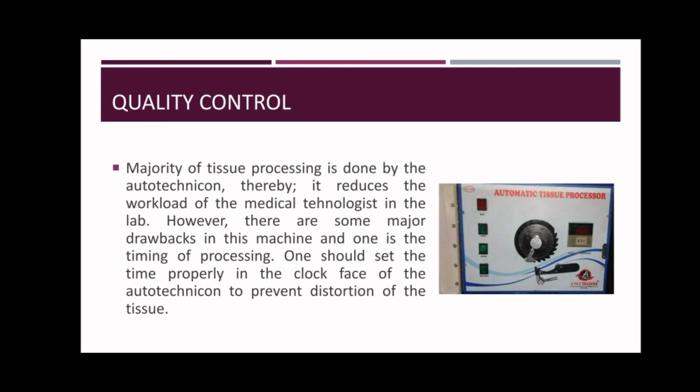In each laboratory section, there's always QC. The majority of tissue processing is done by the Autotechnicon, thereby reducing the workload of the medical technologists in the lab. However, there are some major drawbacks in this machine, and one is the timing of processing. So it is very important that you set the time and calibrate the machine properly so that it will hit the exact time, and the tissue will not be overly fixed, overly dehydrated, and also not under-fixed, under-dehydrated, under-cleared, and under-infiltrated.